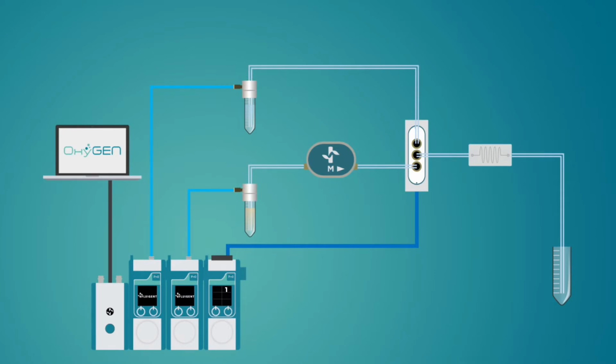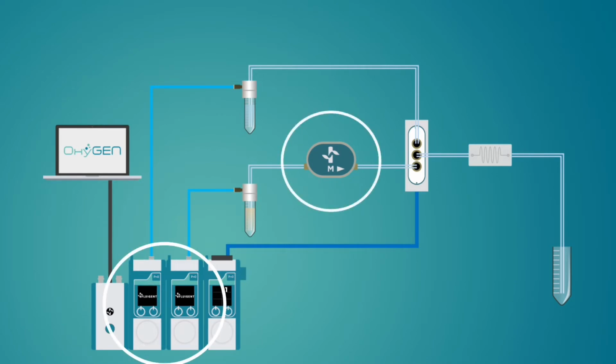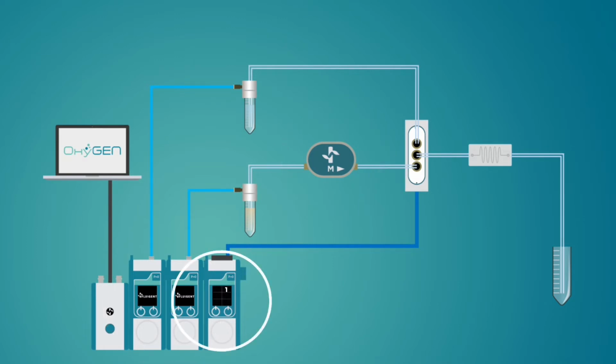Now let's say we want to create an automation protocol for an experiment based on one reservoir with water to rinse, one reservoir with a specific liquid, one microfluidic chip, and a reservoir for collecting waste. For that, we need a link module, 2 flow easies, where one has a connected flow unit, and a switch easy with a connected 2 switch. With this setup, we want to automatically inject the sample liquid at a given flow rate for a specific duration.